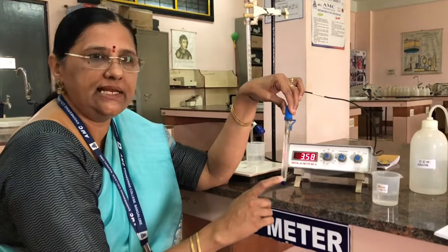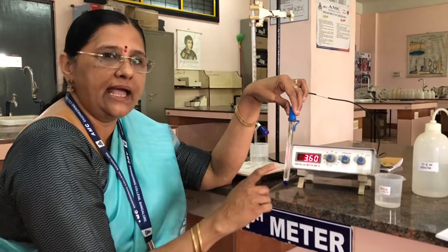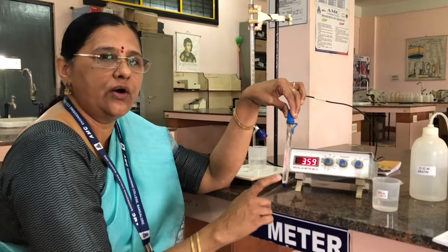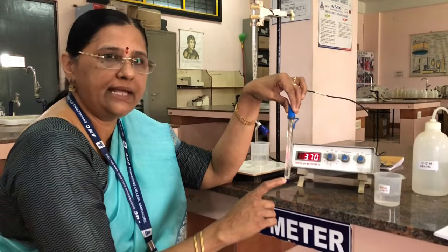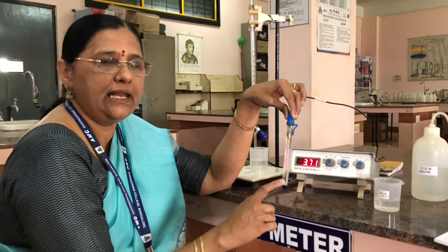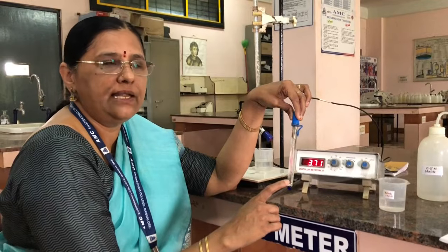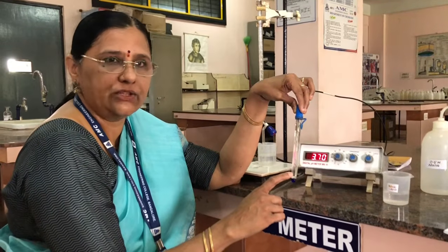That's why the combined glass electrode is called an ion selective electrode, or a membrane electrode, where it consists of a glass electrode and a calomel electrode. The glass electrode acts as an anode and the calomel electrode acts as a cathode in this.